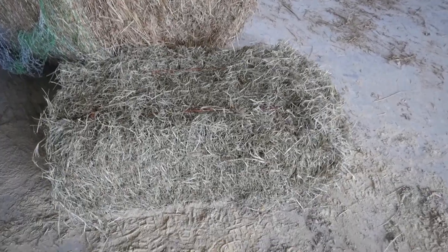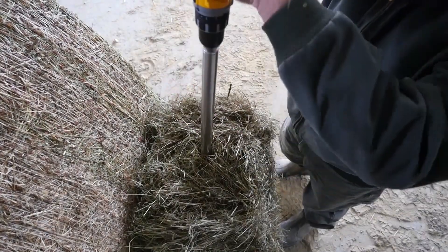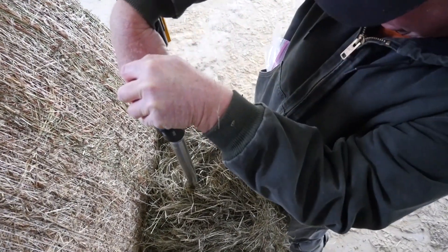For square bales, you're going to want to go through the end of the square bale so it goes through all the different flakes of hay. Again, you're going to want to sample several different bales to represent an entire lot of hay.